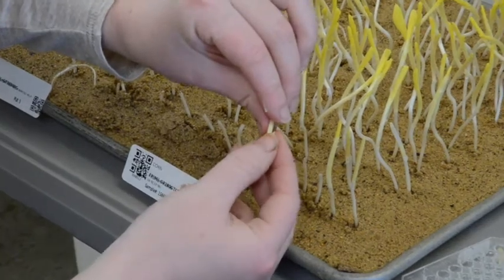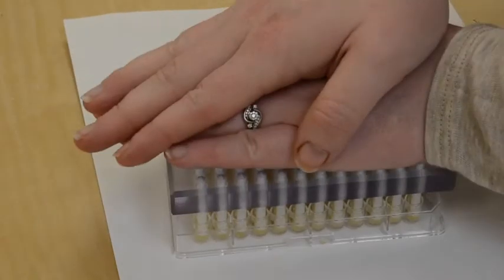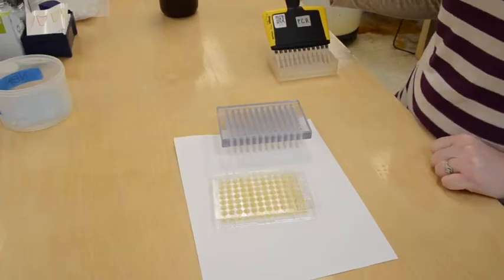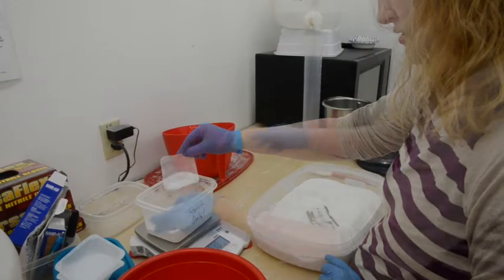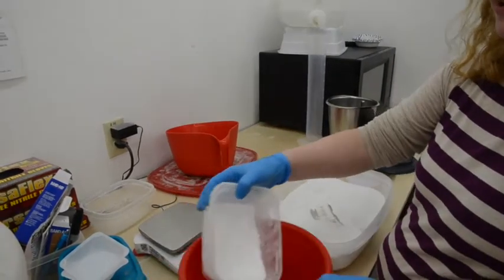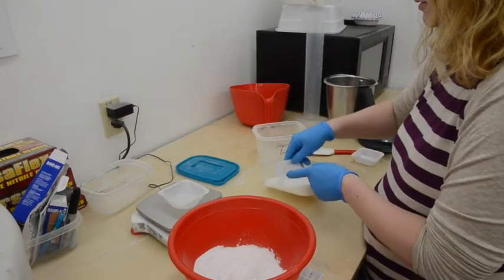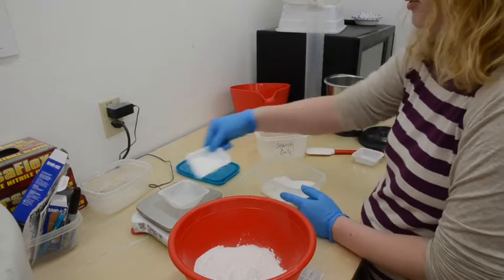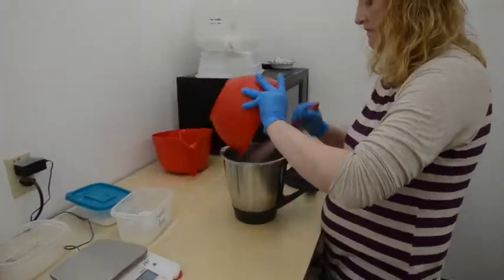Coleoptyl and mesocotyl tissues are then harvested from each seedling, crushed, and placed in extraction buffer. After the samples are harvested and placed in extraction buffer, we make starch gels. We use potato starch as it is a natural biological product that does not interfere with the enzymes.